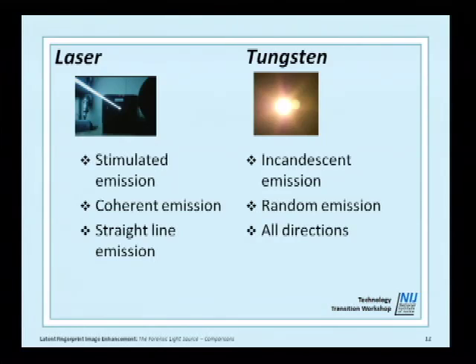And of course, in that sense, the older photographers in the room will remember the inverse square law, where the intensity of your light falls off as a function of distance. That doesn't happen in theory with the laser because the light does not diverge. So in theory, in a vacuum, the light is as strong at 5 miles as it is at 6 inches, which is why we can use a laser pointer to indicate. You can have a far, far more powerful tungsten source, and it simply won't do that. All it'll do is illuminate the whole screen.